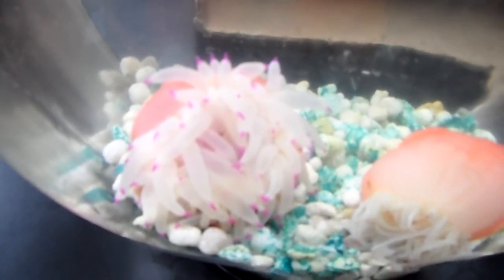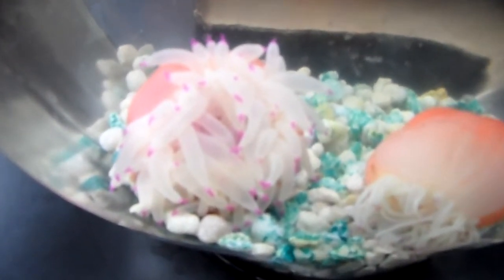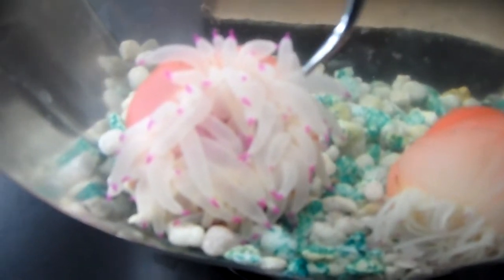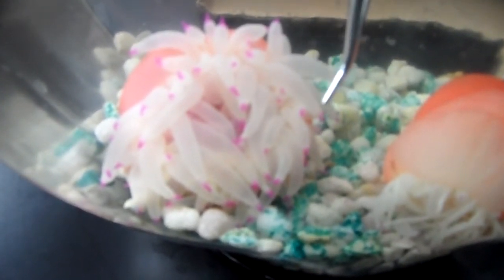Alright, so I'm going to go ahead and touch the anemone and we'll see if there's any kind of reaction. So here comes the blunt probe, Mr. Anemone. So I'm just touching one tentacle.